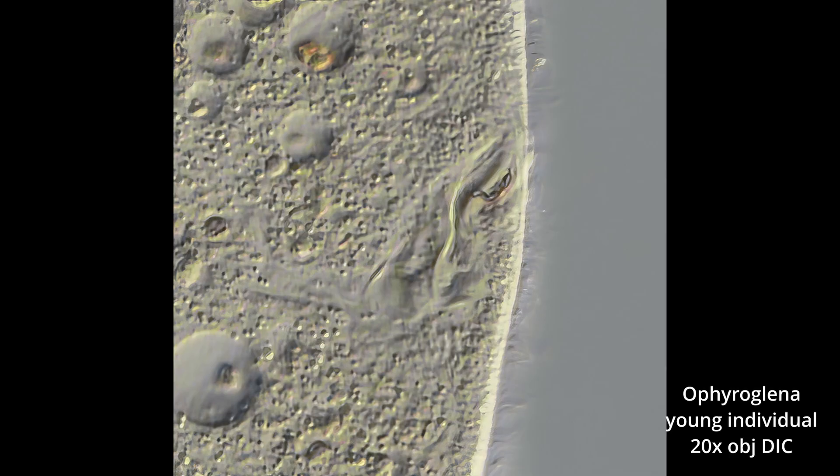Here is a crop, again at 20 power, of the mouth area. The arrow shows what looks to be like a coppery bridge, which I think is the light sensor. It's kind of interesting the way it was rendered in DIC.